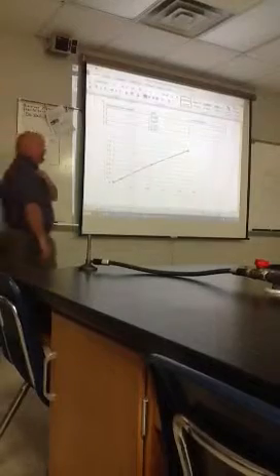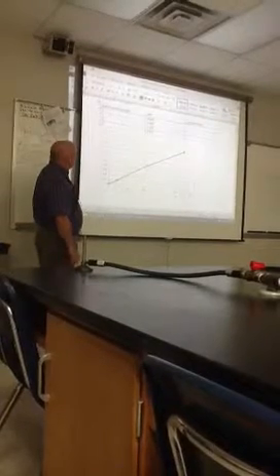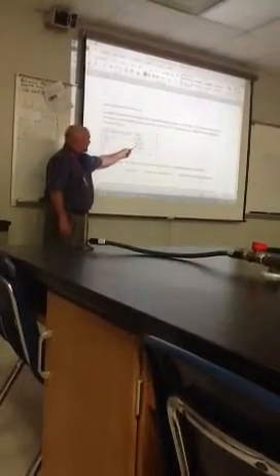And when we graph it, we could put it on a graph. And that's actually what it comes out looking like. That's real data that I graphed. So at that high concentration, the first one, we had an absorbance of 1.852. When we took 110 milligrams per liter, it was 0.968.